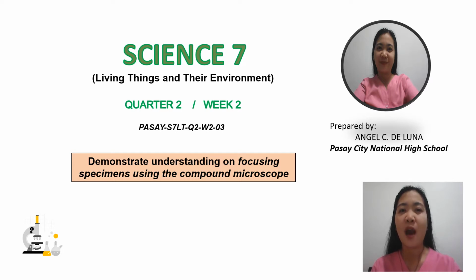LT-Q2-W2-03. Our main goal for this lesson is to demonstrate understanding in focusing specimens using the compound microscope. I hope that this would be an interesting discussion for you. Are you ready to learn? Let's start!